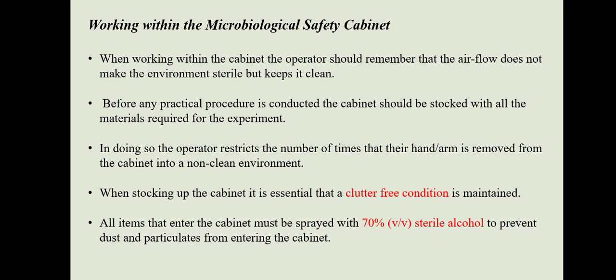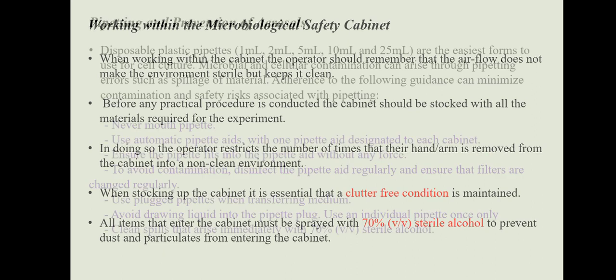In doing so, the operator restricts the number of times that their hand or arm is removed from the cabinet into a non-clean environment. When stocking up the cabinet, it is essential that a clutter-free condition is maintained. All items that enter the cabinet must be sprayed with 70% V/V sterile alcohol to prevent dust and particulates from entering the cabinet.